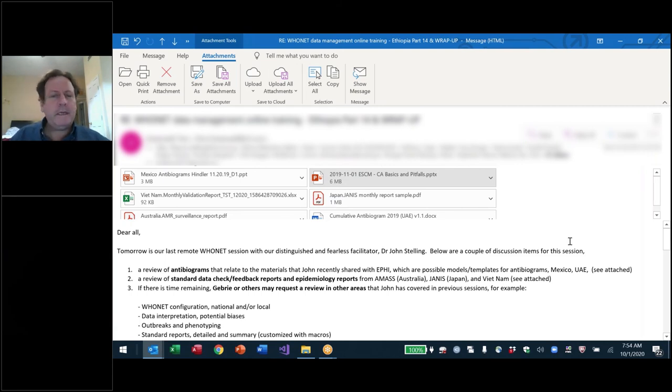So good data, bad data, biased data, unbiased data, all of these have a value, and you need to understand the value in order to appropriately utilize it. One of the purposes of the data is to improve the data system. More complete data entry, more accurate data entry, better microbiology, better testing, normal results, not strange results. So this is data collection to improve data quality.